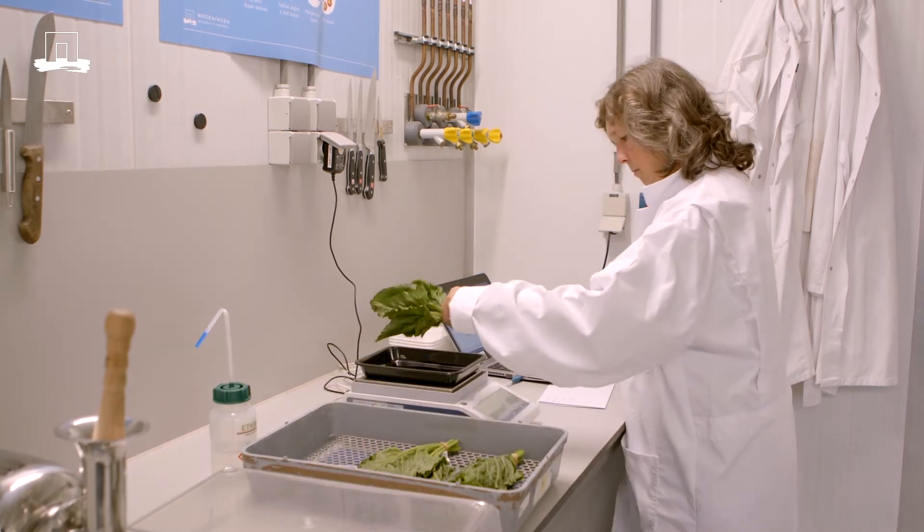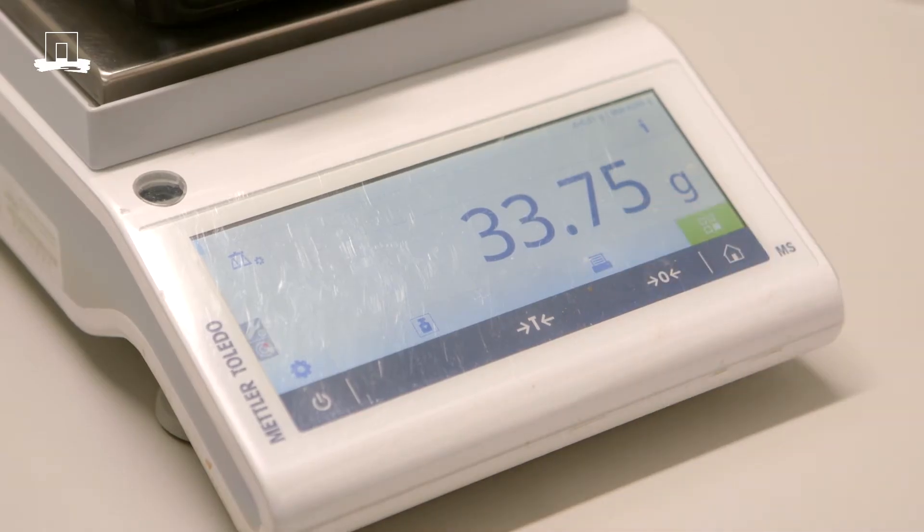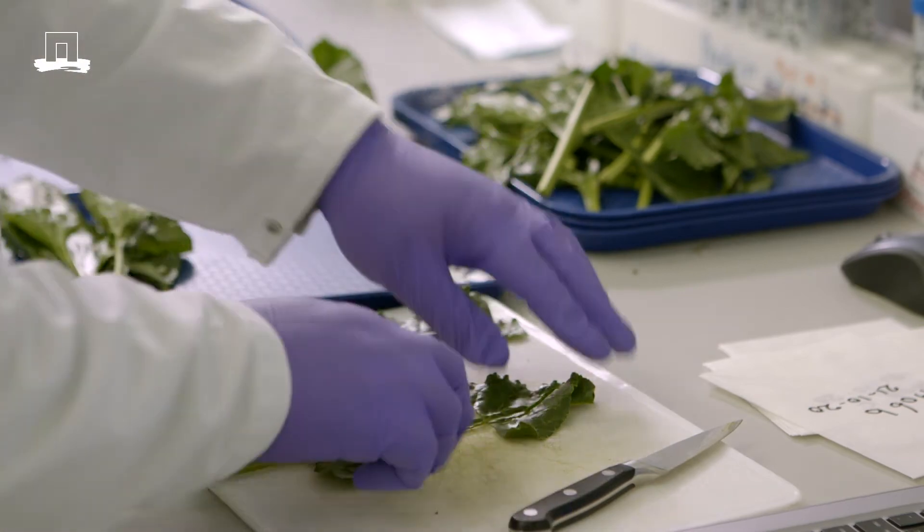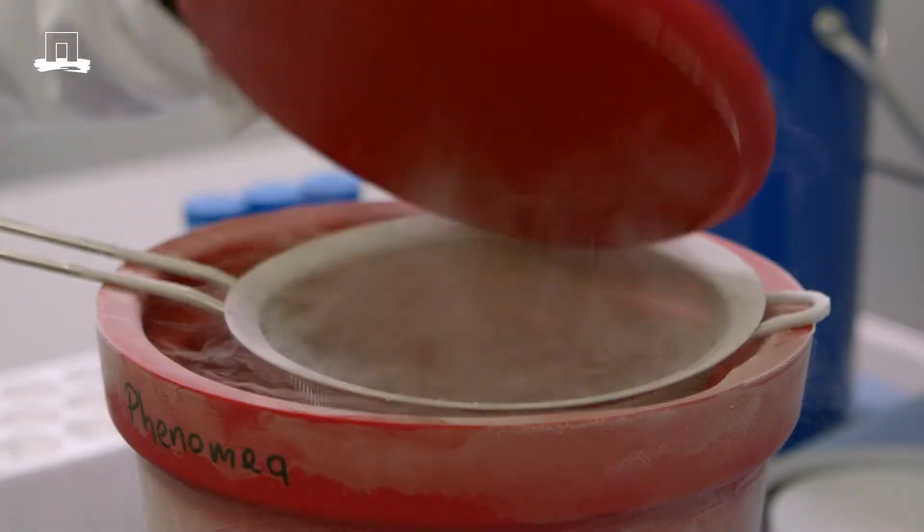Samples are taken at different moments in time. We determine weight loss and freeze the samples for protein analysis at a later moment.